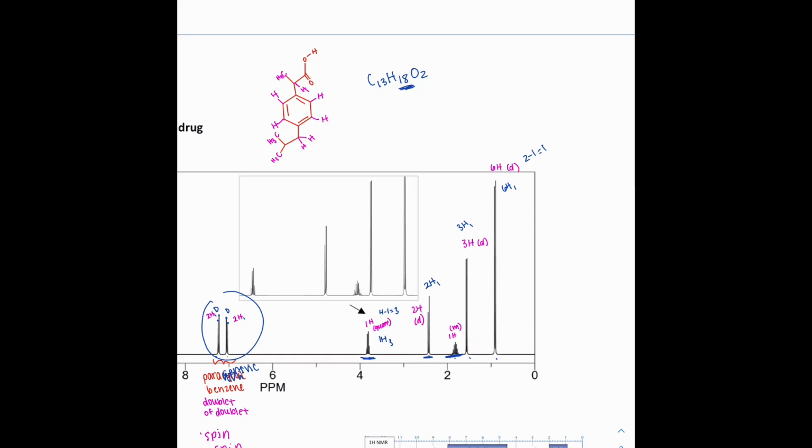I think it does get a little complicated when you have so much over here, but you can also consult a table such as this one, with more spectral information, like this is going to be more indicative of alkenes over here, which we can compare to our methyl groups and alkanes.